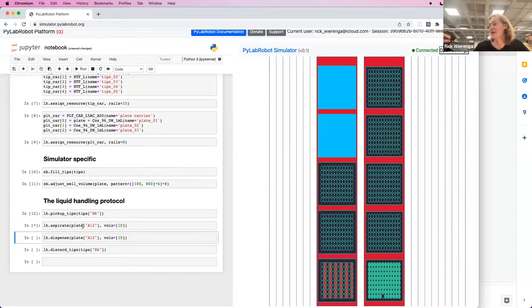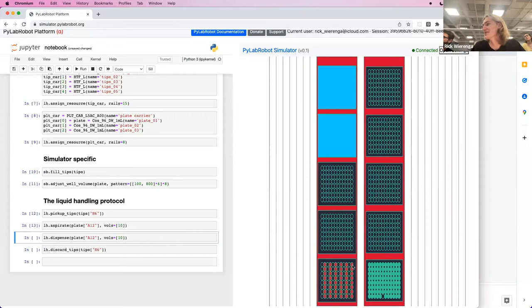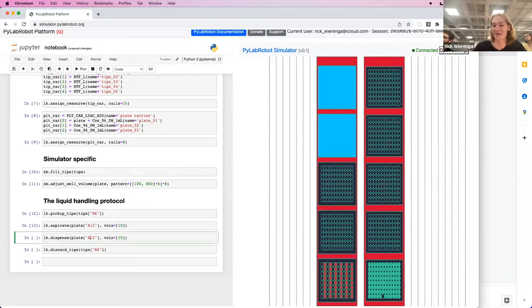Then we aspirate from the top right here. It's just 10 microliters. So it's not really visible, but we aspirate it. And then we dispense into the same well.